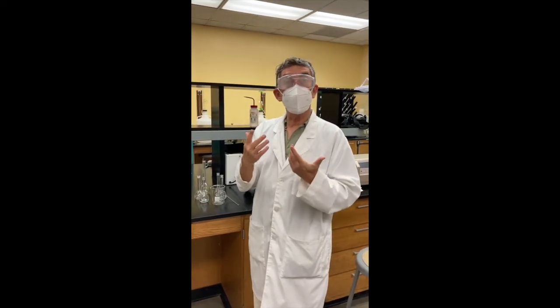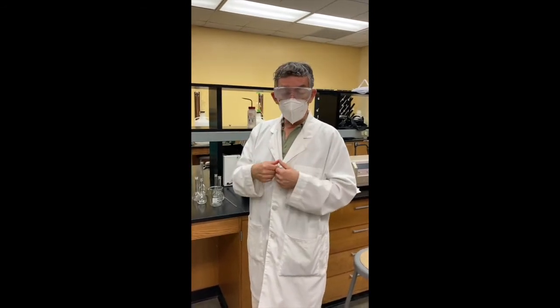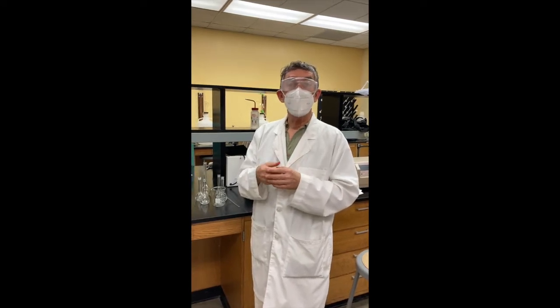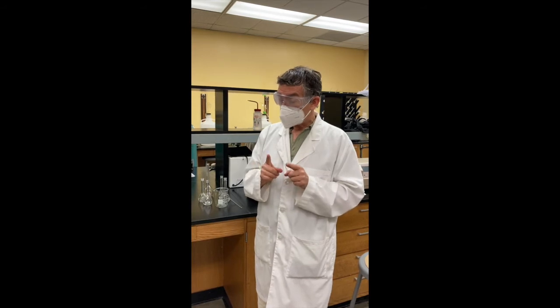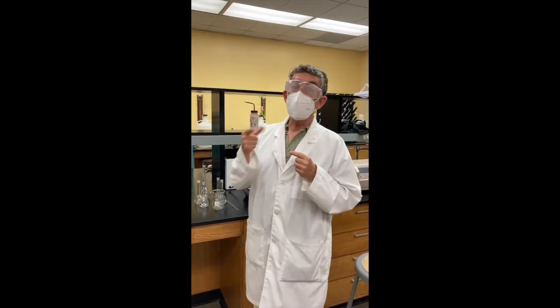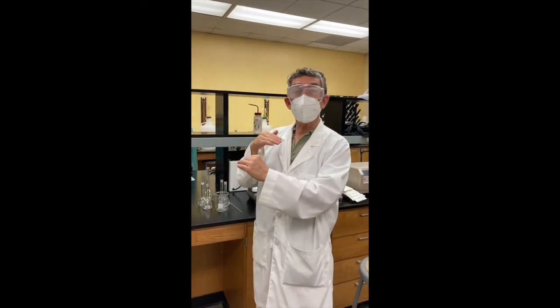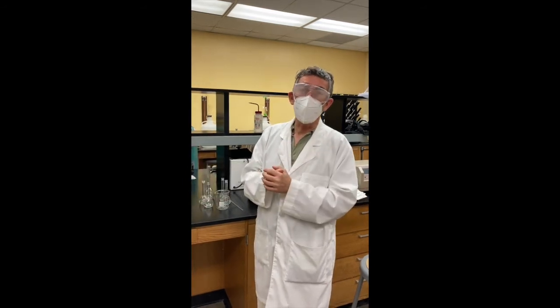So we're going to measure the viscosity, and there are some theoretical equations that will relate the viscosity to the molecular weight. One thing though, the viscosity is dependent on concentration. So to really get at the molecular weight, you have to take several measurements at different concentrations, extrapolate to zero concentration, and there you go.